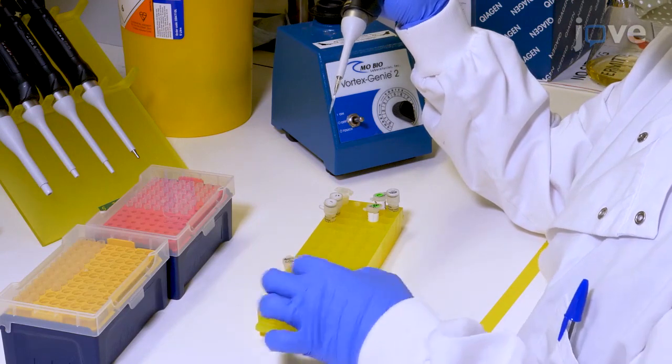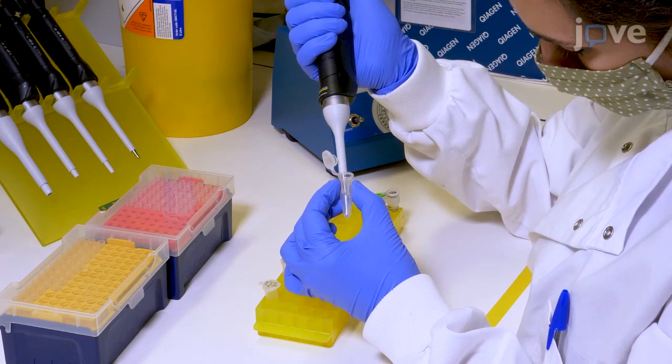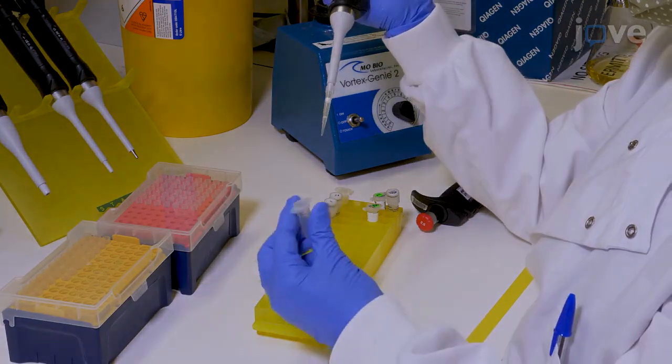Precipitate the DNA by adding 0.1 volume of 3 molar sodium acetate and 2.5 volumes of ice-cold 100% ethanol.